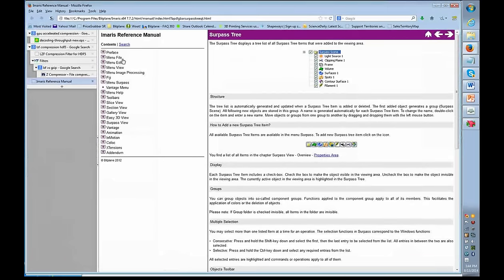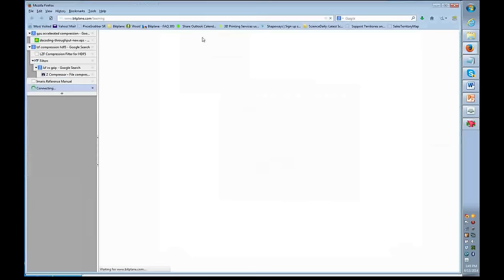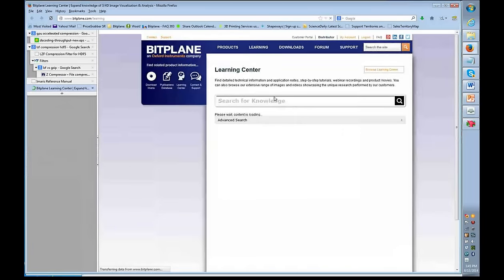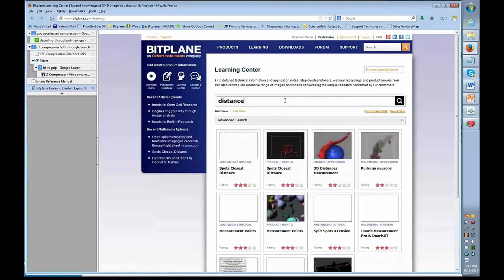In the help menu, you have the video tutorials. That's a link to the website. There's also some local tutorial content, the quick start tutorials. And if you go to the video tutorials, that's actually part of the Learning Center. It's pretty well indexed, so if you just type in a particular term, you can find some videos and how-tos relative to a particular keyword.